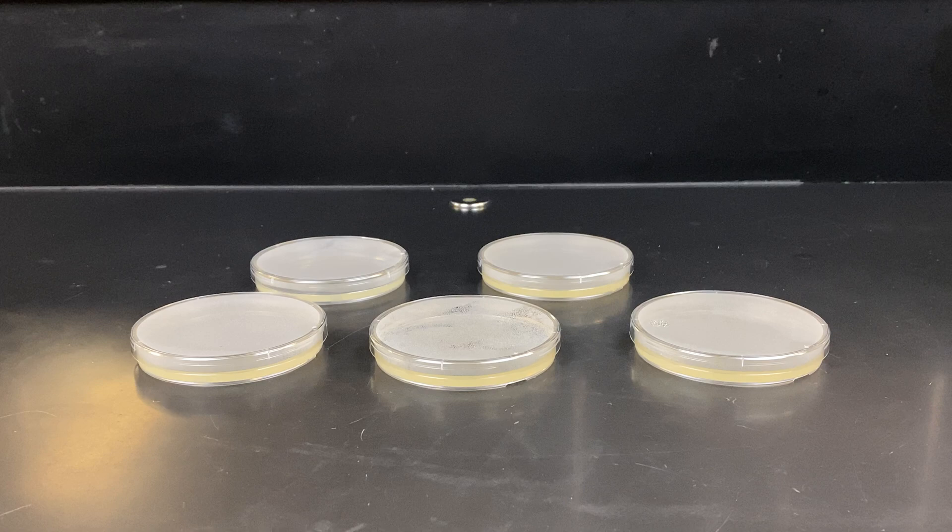Welcome to my lab. I'm Drew Collip. In today's lab we're going to make LB agar plates. I will demonstrate every step of the process, from mixing the powder with the water to autoclaving, to letting it cool, pouring the plates, and stacking them for storage later on.